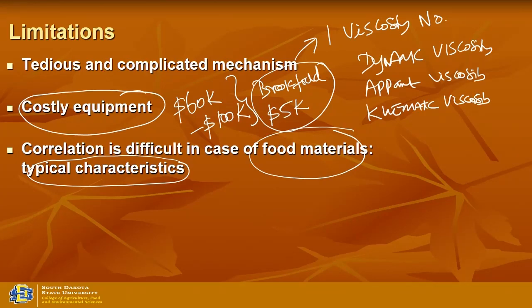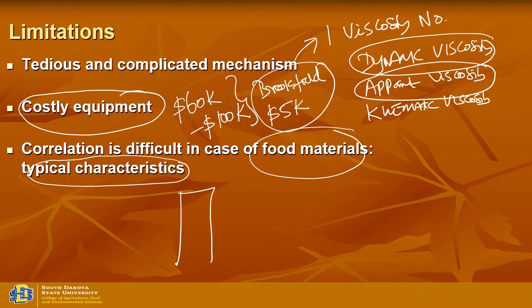Okay, there are 3 different viscosity values out there in the literature. One is apparent viscosity, and that's the thing we are going to be measuring when you characterize these samples. That is called apparent viscosity. Dynamic viscosity is the one when the medium is some type of liquid. That's what you are measuring, the viscosity of that liquid.